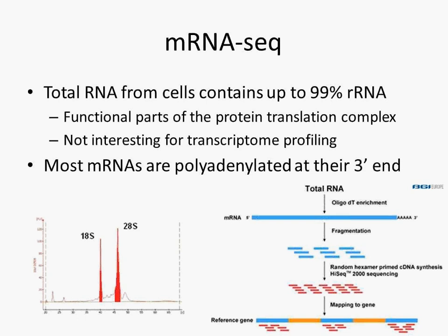Sure. It would also allow us to quantify really how many non-adenylated RNAs we have missed in the lines, and at least evaluate if it's really relevant or not, or if we should completely switch the protocol to something that is more like a Ribo-minus type.